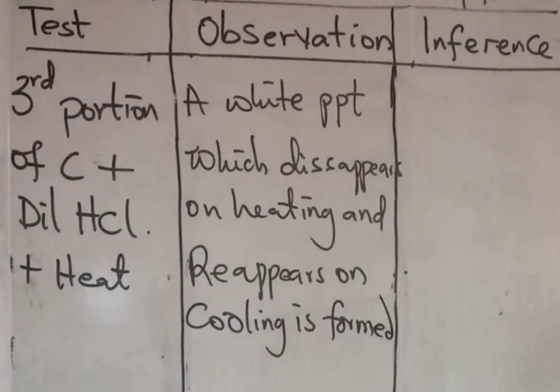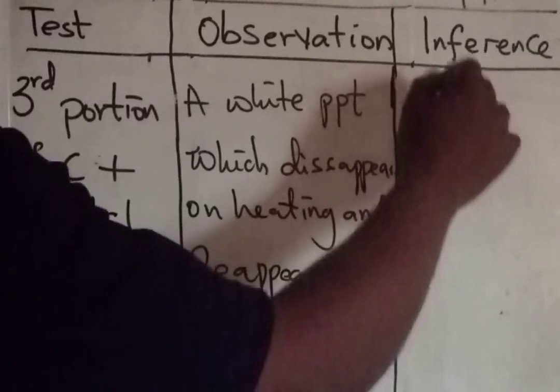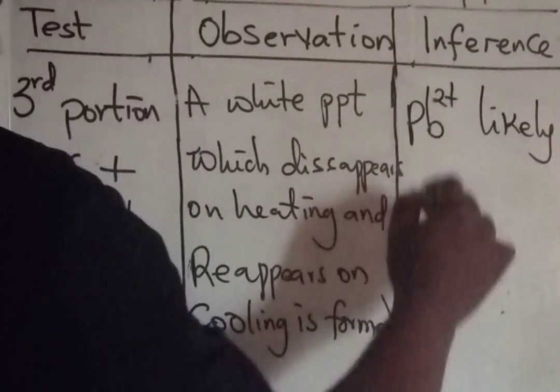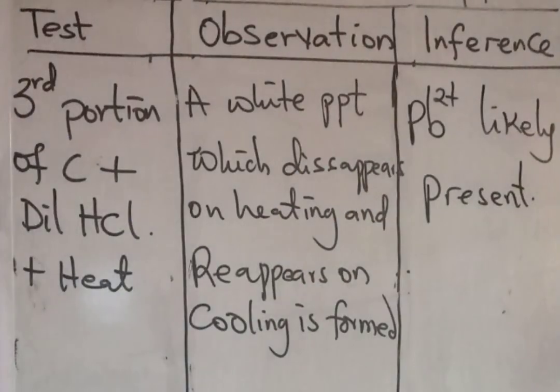When that happens, it means that lead-2 ion is likely present. So your inference will be: lead-2 ion likely present.